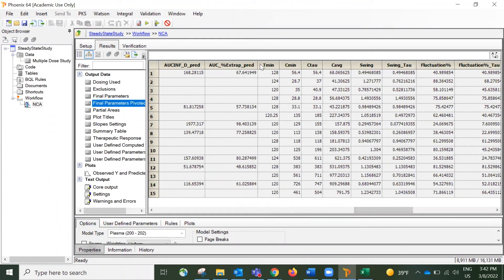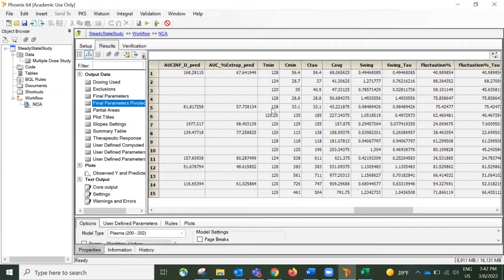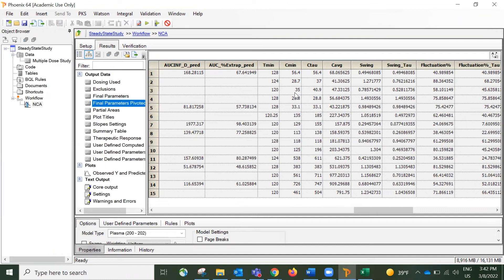So starting from this column, we have T-Ming. T-Ming is the time when the C-Ming happens. And C-Ming is the column right next to T-Ming. This is the minimum observed concentration. And for steady-state, it occurs during the dosing interval.